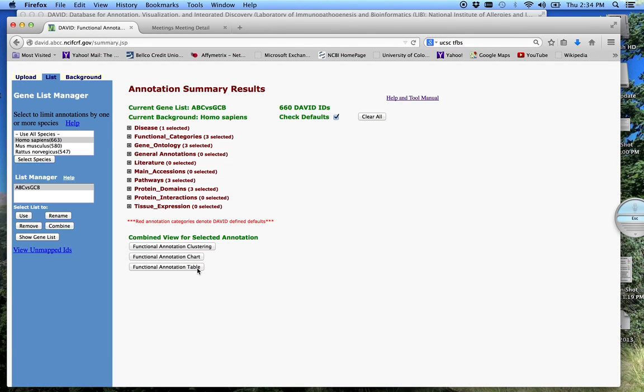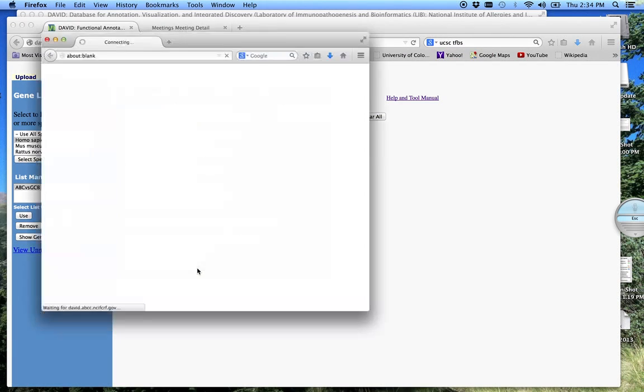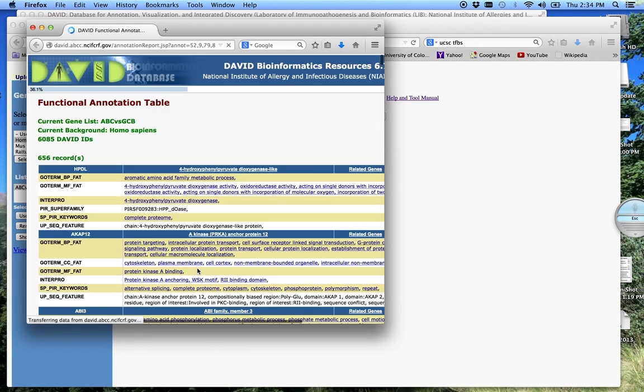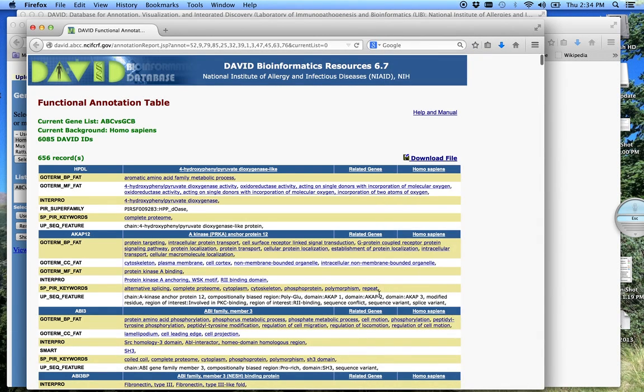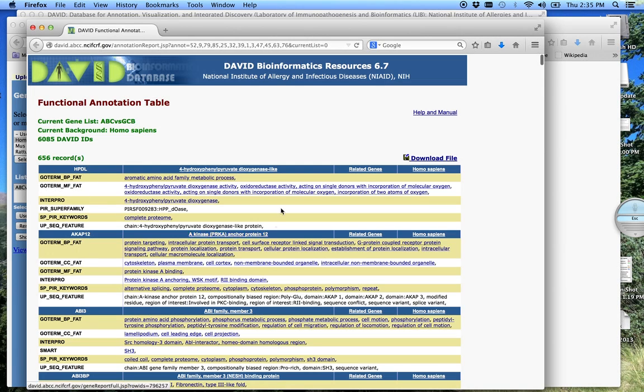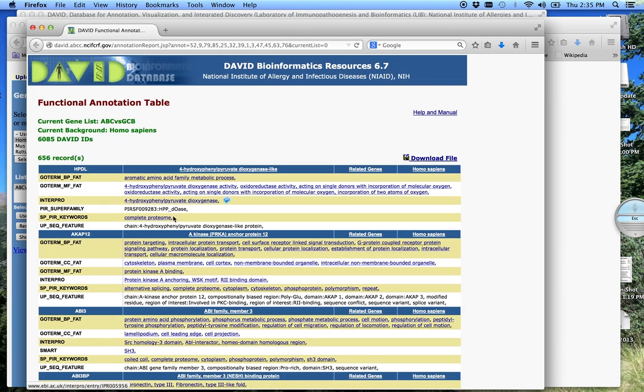And then the functional annotation table. And this basically just gives you a list of all of your genes. So all of our genes are listed here in alphabetical order. And these are the functional categories associated with this. And again, it's using all those databases in red to pull from to construct this. This page is very good if you want more specific information on your genes.